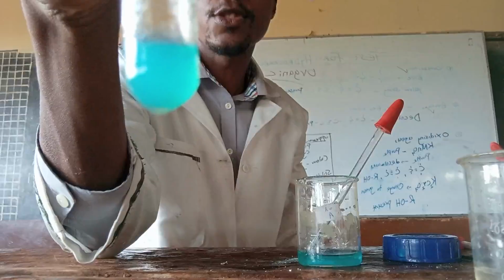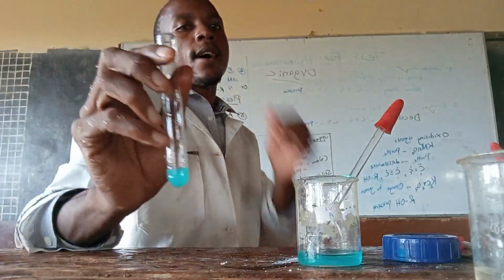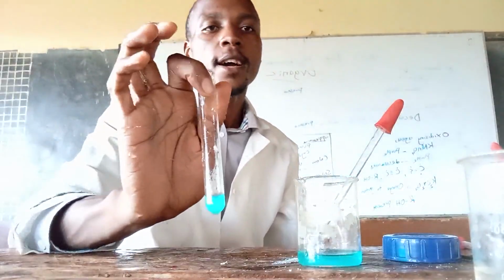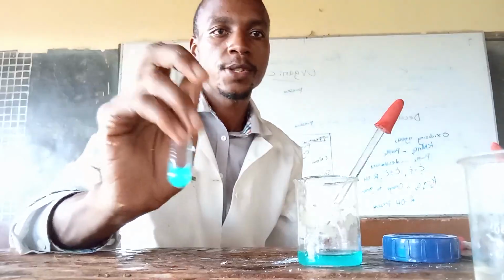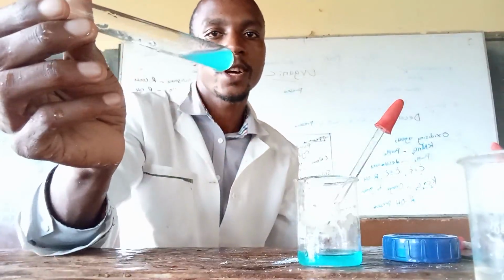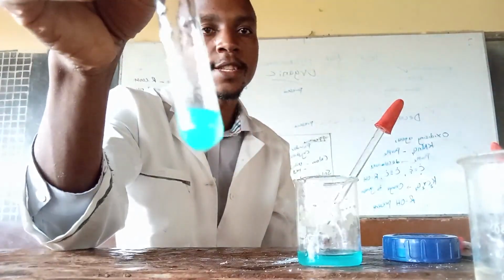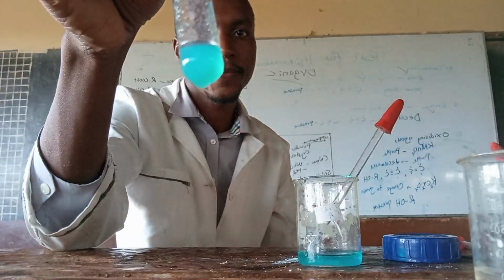This is not a solution anymore. It is precipitates. What is the difference between a solution and a precipitate? A precipitate can be filtered to form a residue and a filtrate, but a solution is homogeneous. You cannot get a residue and a filtrate. So with this one now, there is a residue. You can filter this one.